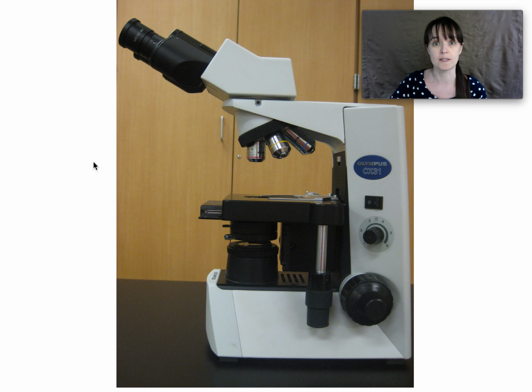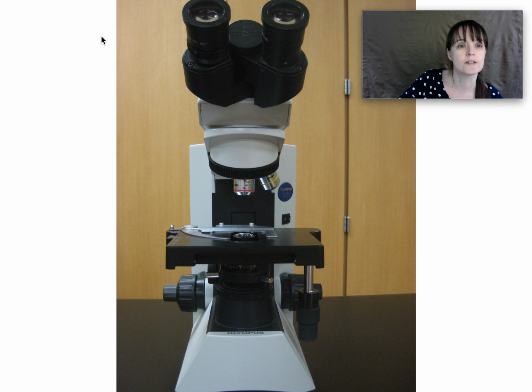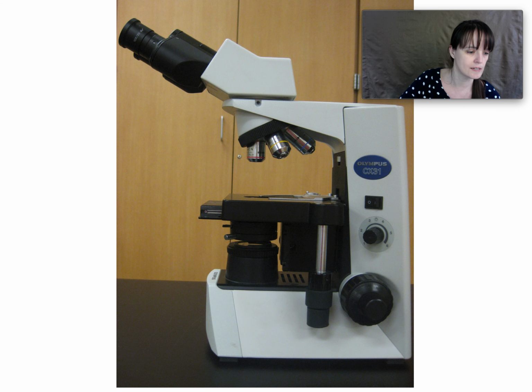So I apologize. Okay, so we need to know these structures right here. Pen color red, still an automatic though. Okay, pen. There we go. Okay, these are the ocular lenses. And ocular has one C.